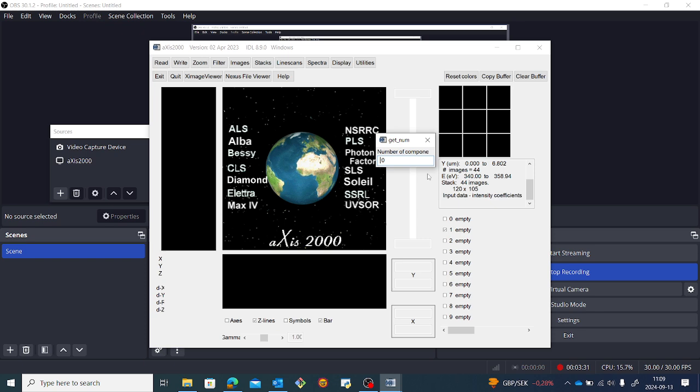But also, there is a way, if you know your sample well, you can also obtain internal standards by extracting the spectra from your samples. So in my case, I'm going to use 3 standards.